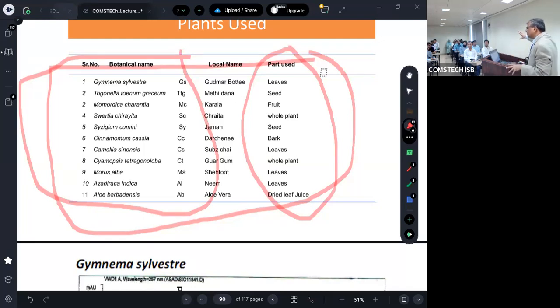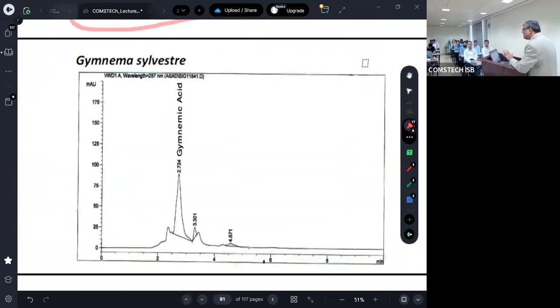Same is true in the natural products, in plant materials. The leaves, now it is the mango season. The properties and components in the leaves in this season, versus the winter season, may not be the same. So first, with these 11 extracts, what we did was HPLC.